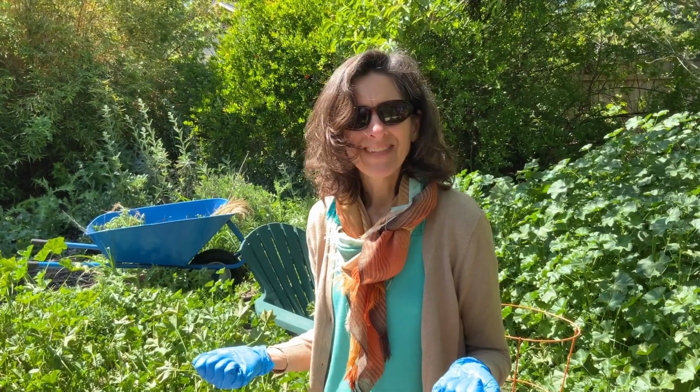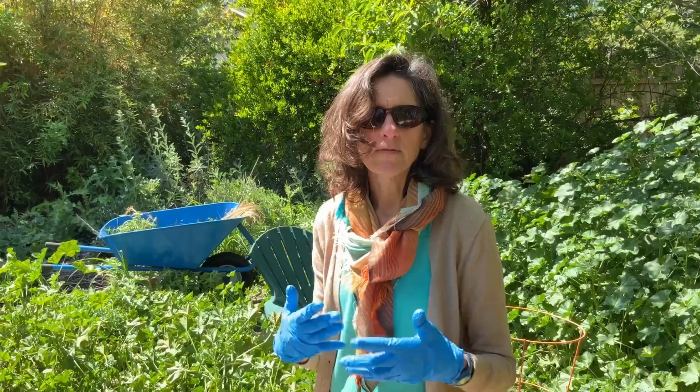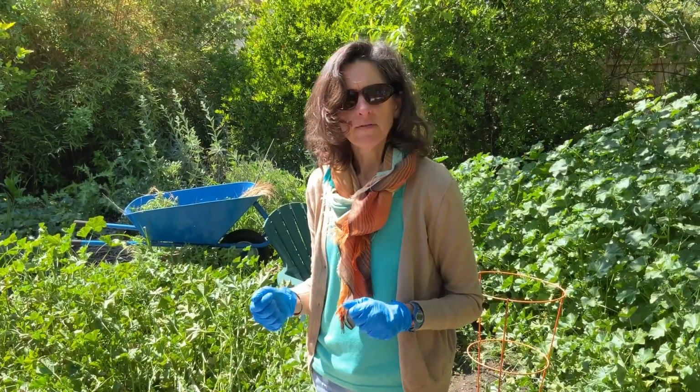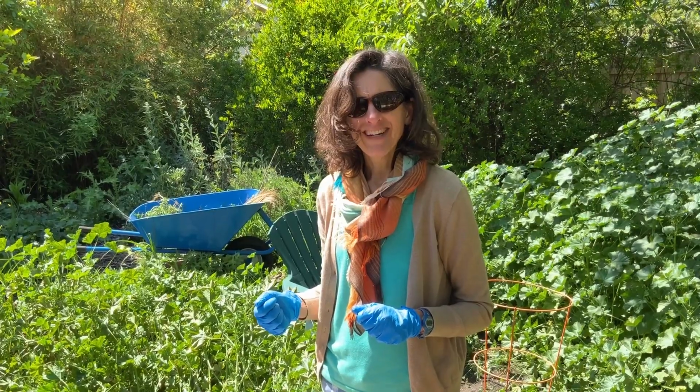This is pretty low turbidity, so this means that it was fairly clear water. Yeah, so 1.85 is very low, especially for Poudre Creek. All right, that's really it.